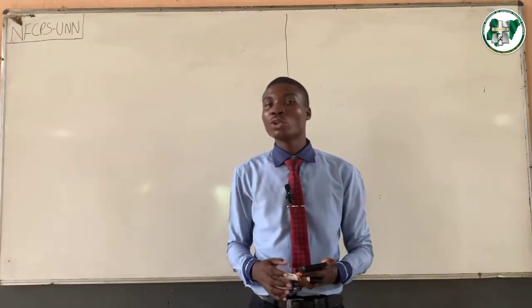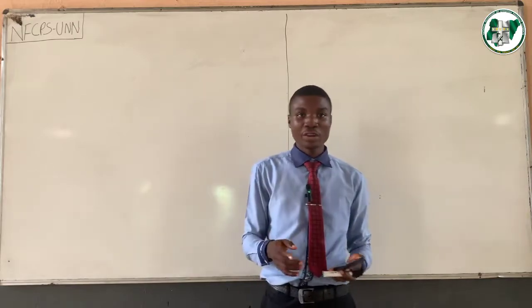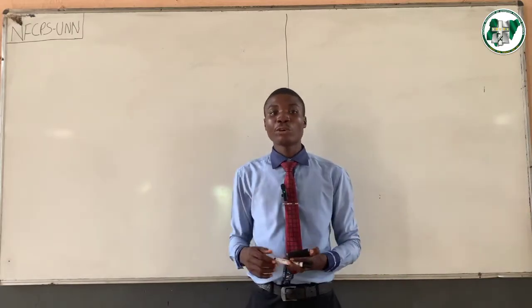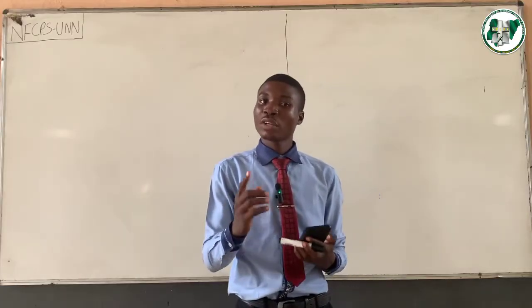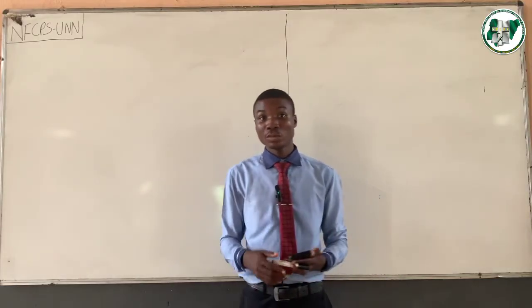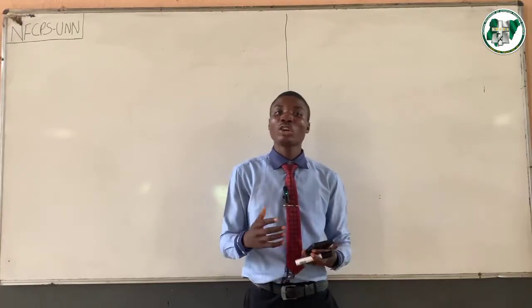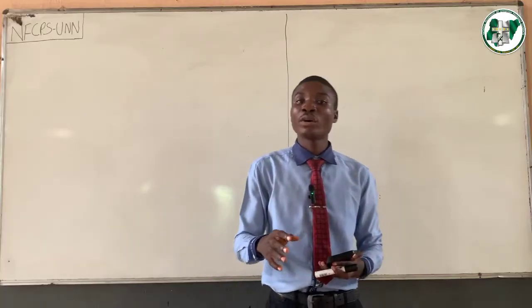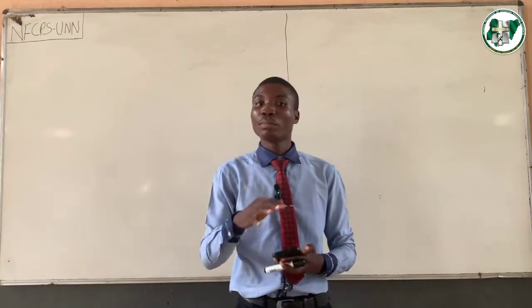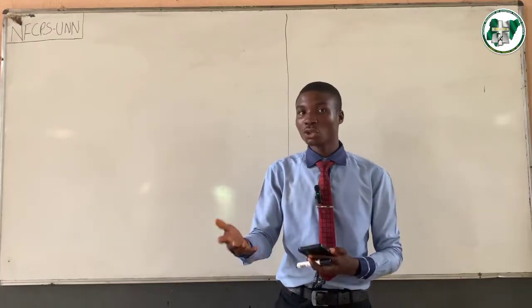So today we are going to be doing a tutorial on adsorption experiment. And right standing before you is a 400 level pharmacy student, as at this time when this video was being recorded, Ede David Chibuzo. So we're going to be talking about the adsorption experiment, and I'm going to be explaining to you some of the hacks that will help you to do very well in your adsorption practical, both the normal practical and the practical which you have as your examination question.